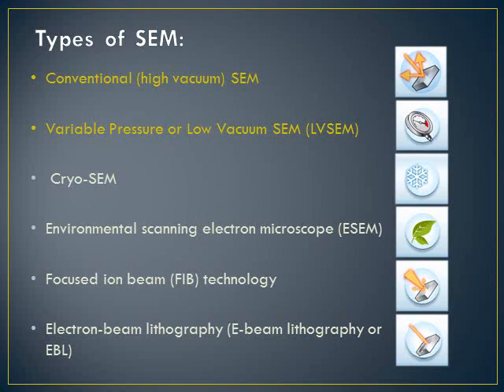It is particularly useful for viewing polymers, biological samples, particulate samples, geological materials, and museum samples that cannot be changed in any way. Imaging uses backscattered electrons.